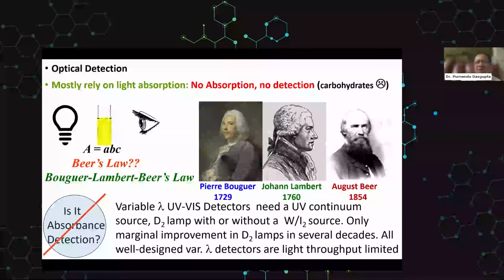So the signal to noise will always be N over square root of N, or square root of N, the square root of the number of photons. That means you have to have a bright light source, enough light reaching the detector, that's going to control your signal to noise if everything else is great. Okay? So that having been said, light throughput is what matters.